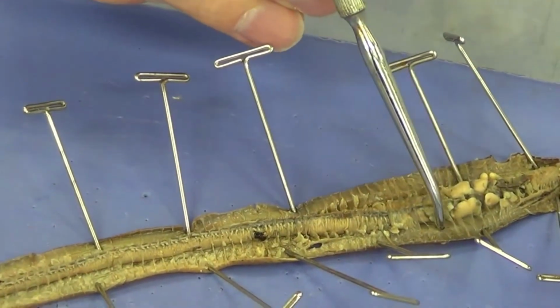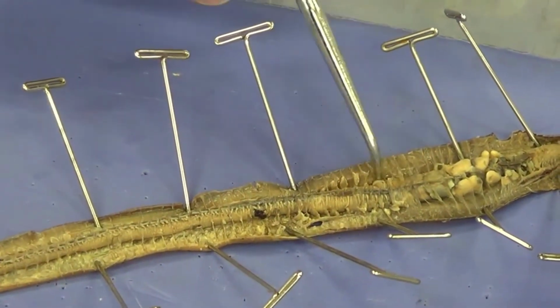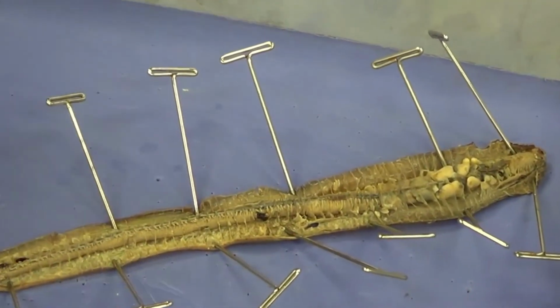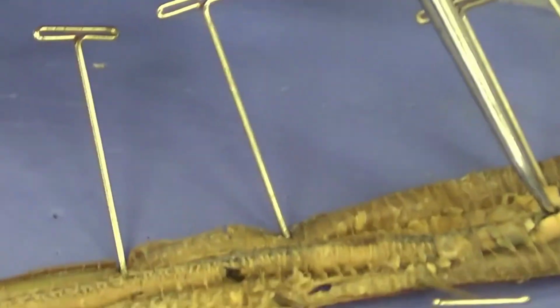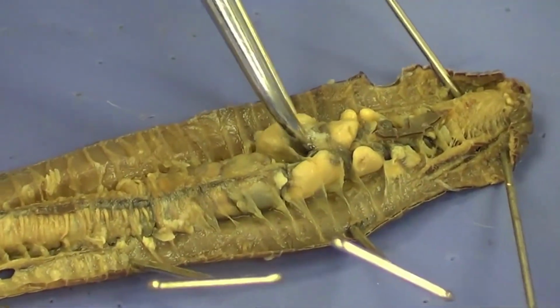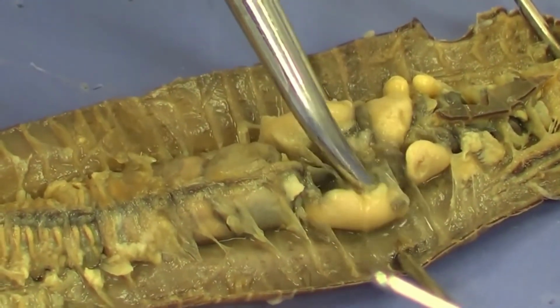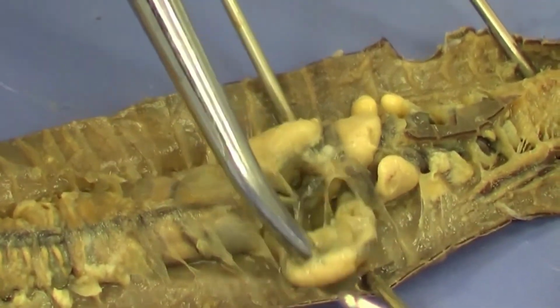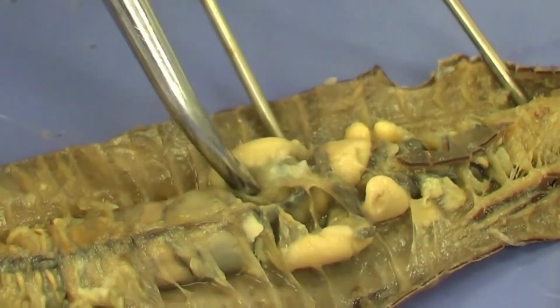This is all going to be our coelom, and you can see the various septa along there too. Now let's go ahead and take a look at these cream-colored structures right here. We're going to have to actually move them out of the way in order to see our aortic arches. So as you're dissecting, just give them a gentle push. Try not to tear them, but just kind of push them out of the way a little bit.